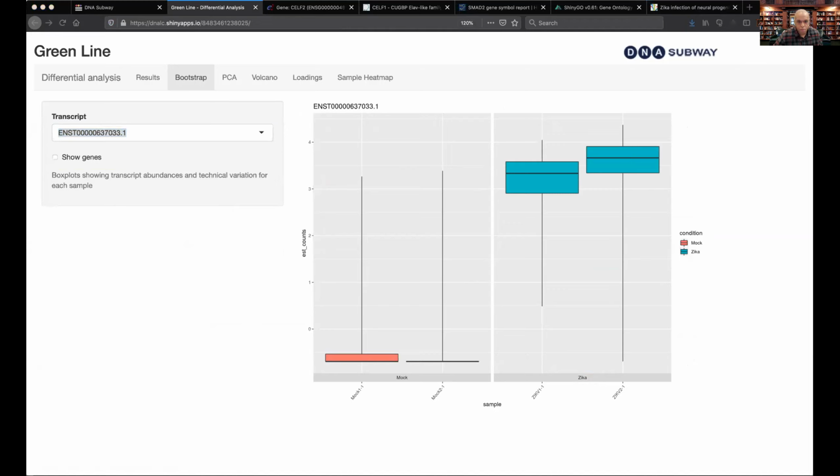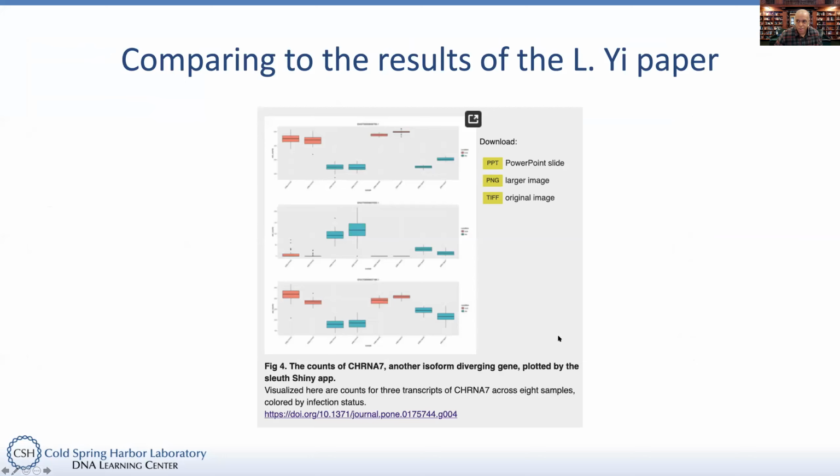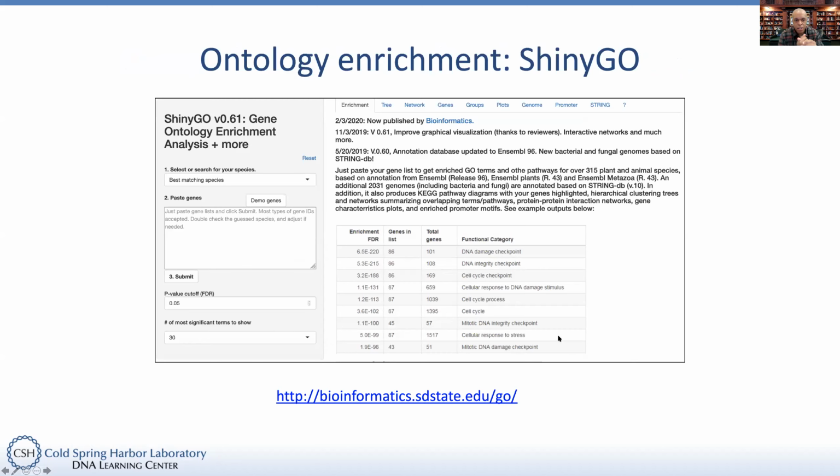So although we could replicate that, the next thing we want to do is look at the ontology. So let me make sure I'm sharing my slides again. We replicated this to an extent, or at least just to get a feel. But the next thing is this thing called ontology. We're going to use this service, but first let me mention what that is.